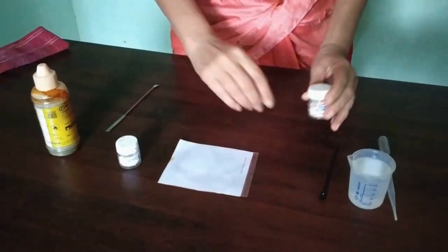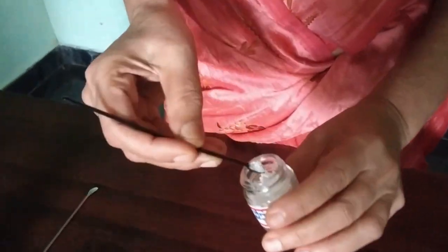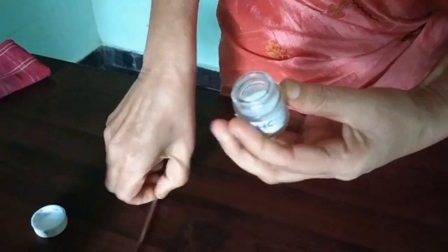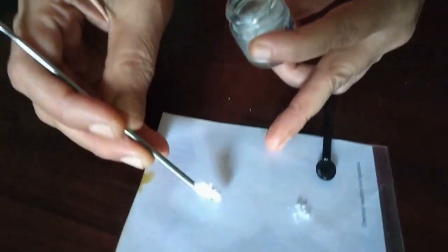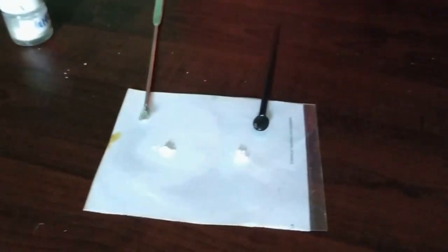So first we shall take these chemicals and put a little of it, that is not even a pinch. Microscale means very small quantities. Now I am taking a little of citric acid and putting it on this laminated sheet of paper. Then take sodium bicarbonate, that is baking soda, and take a little of it, put it on paper, close it, and leave the spatula there. Let us not change the spatula.